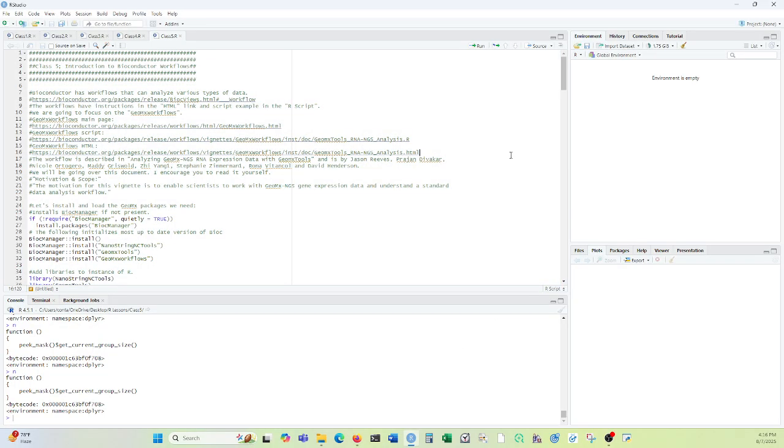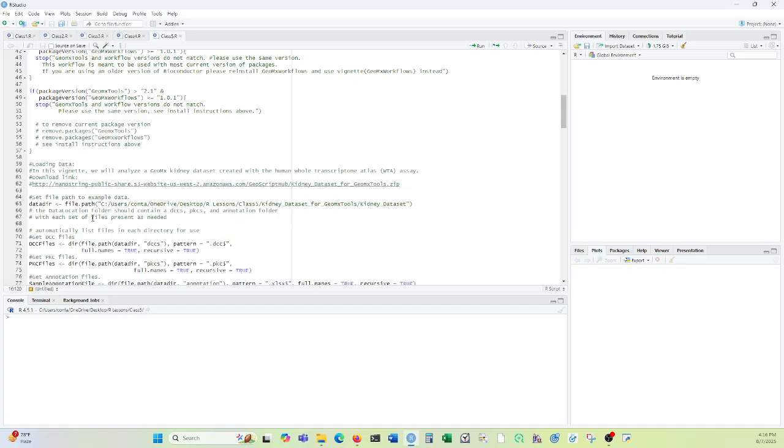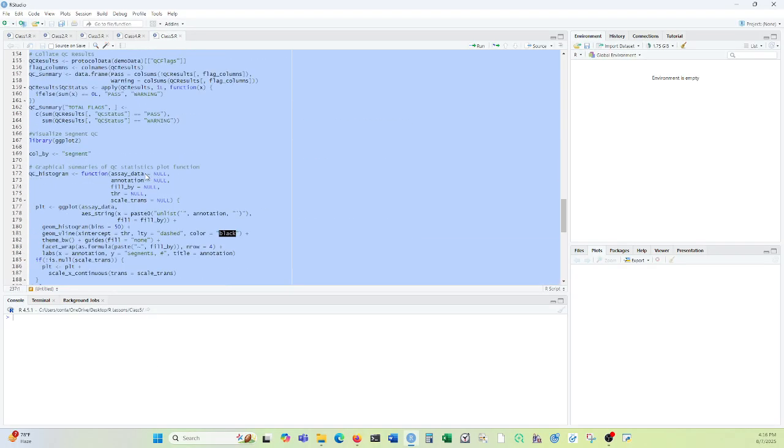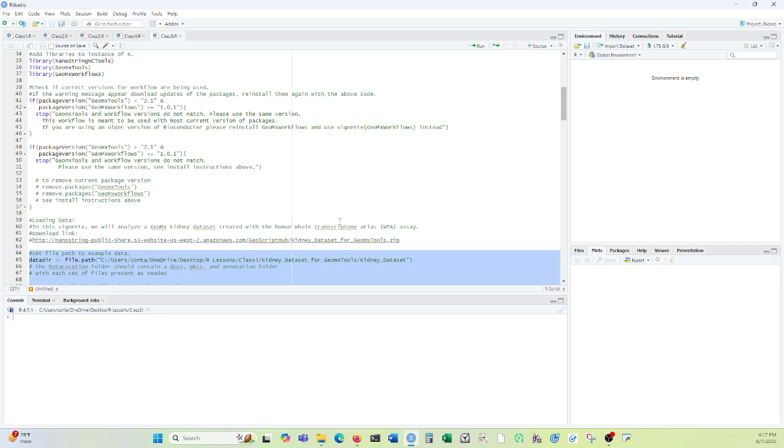Sorry, probably shouldn't run that part. I'm going to restart this. I should just avoid this part right here because it's just asking me over and over again if I have something, which I shouldn't do. So I'm just going to actually do the code that does not include the installation because it will just ask over and over again. All right, and then run.